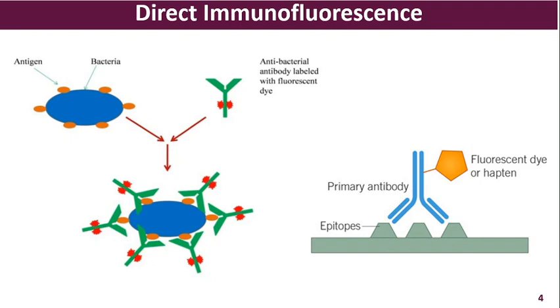When the antibody is added to the cell smear, it will bind to the antigens if the antigens are expressed by a particular cancer cell. And after sufficient washing, when you view this slide under the microscope, if you see the fluorescence, the antibody is bound to the antigen, and that gives the fluorescence because the antigen is expressed by the cancer cell.